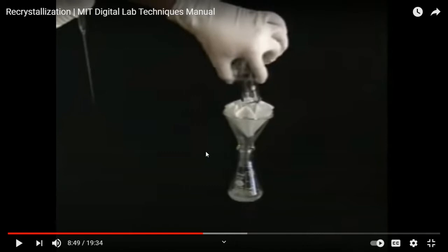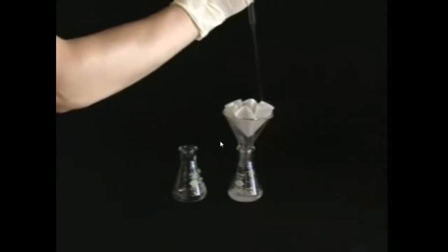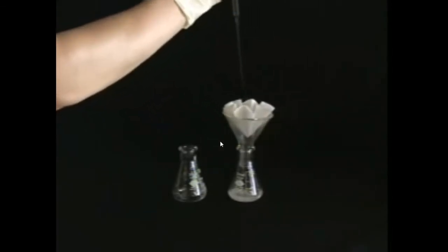I told you from this lab, this course, you guys are doing real science. Whatever major you are doing, these are real now. Finally, rinse the filter paper with hot solvent to minimize product loss.